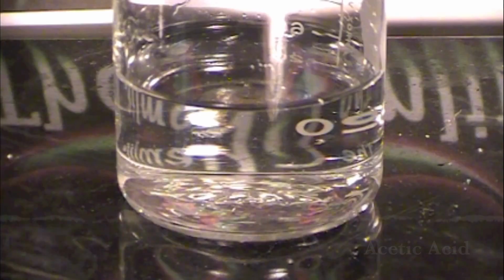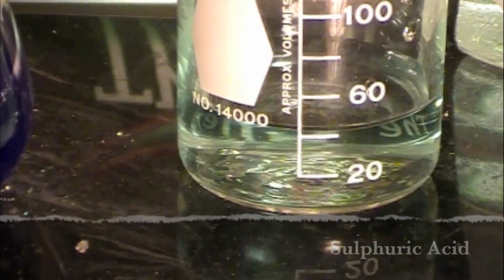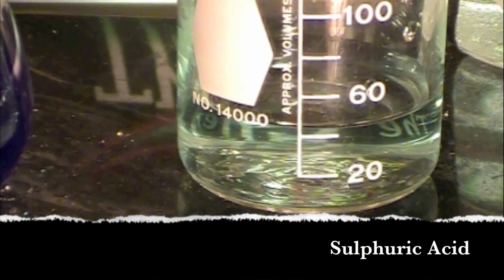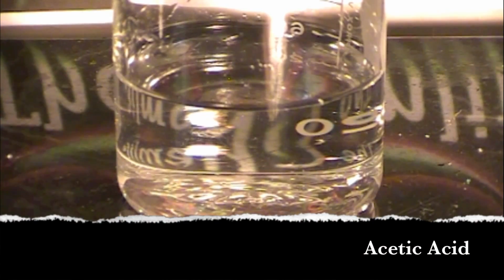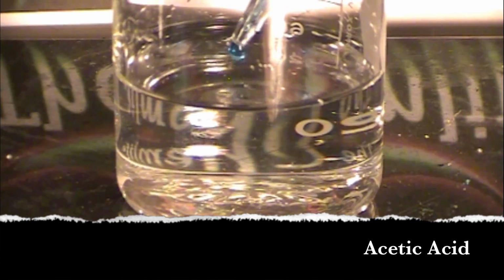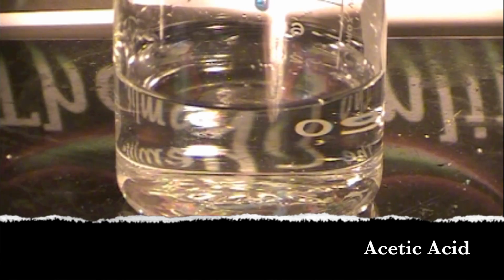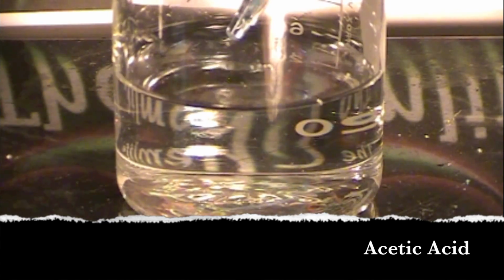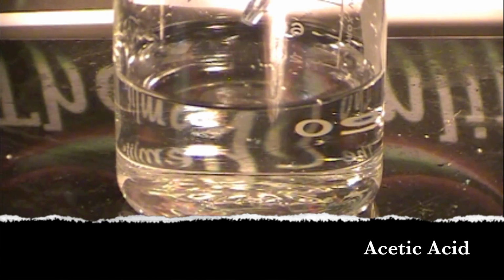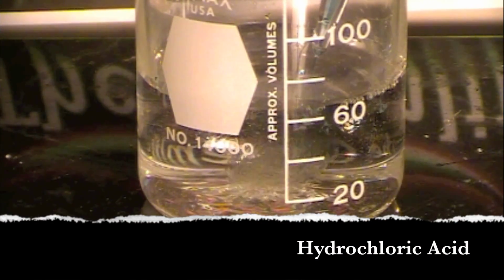Now, to get it out of the complex, we're going to need an acid. So I'm going to be testing acetic acid, hydrochloric, and sulfuric. This is acetic acid. So draw up some of the filtered cellulose solution in a pipette and slowly begin to drip it into the beaker of acid. For acetic acid, you can see these nice long spindly fibers form immediately as the reagent hits the solution.